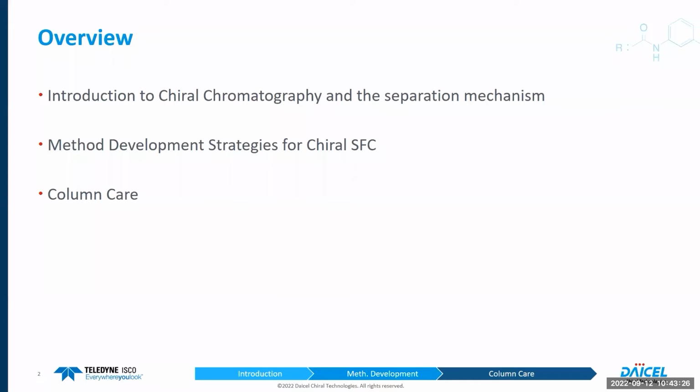As a little overview for the topics that we're going to be touching on today, I usually like to start these presentations off with an introduction to chiral chromatography, just so that we're all on the same page when it comes to nomenclature and background, and then really discuss a little bit about the separations mechanism to help explain why we have so many columns. A lot of the time will be spent obviously on method development strategies for chiral SFC. And then at the end, we'll finish up with some column care topics that are particularly important for SFC, especially as you get into prep.